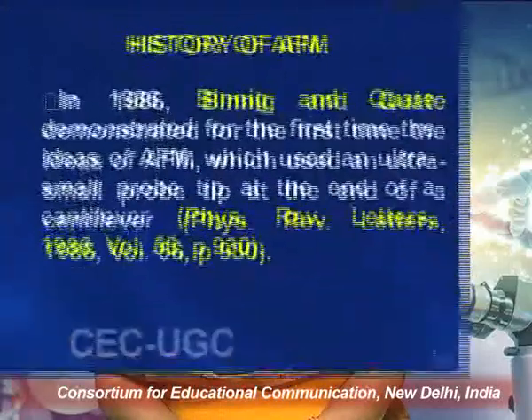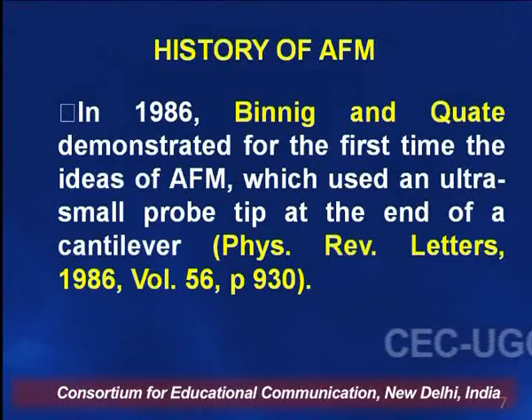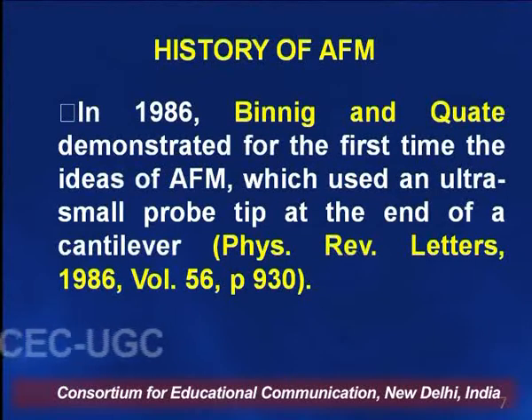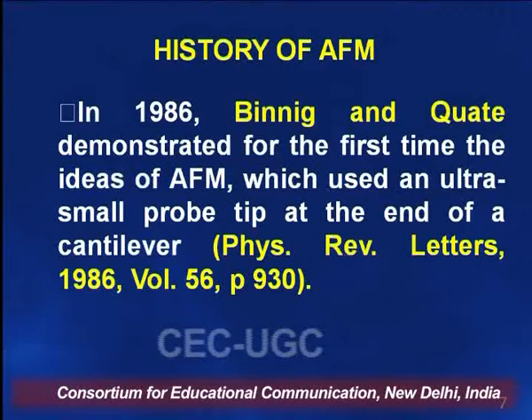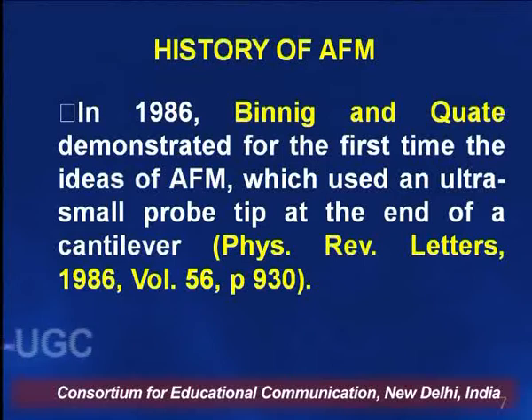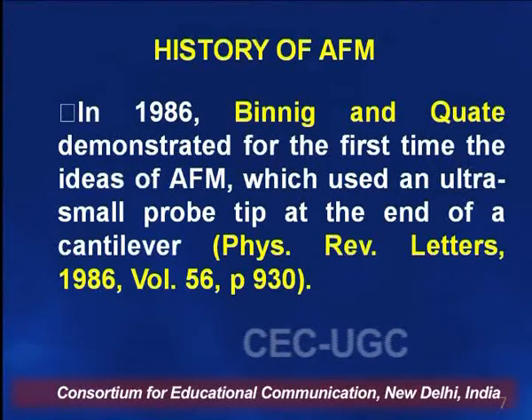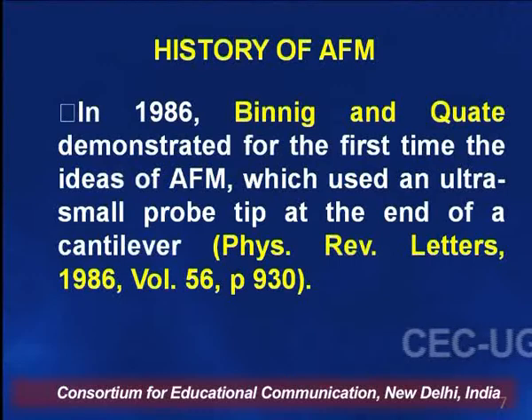In 1986 the AFM was discovered, using an ultra small probe tip at the end of a cantilever. This cantilever plays a very important role in the AFM, and this cantilever contains a tip.